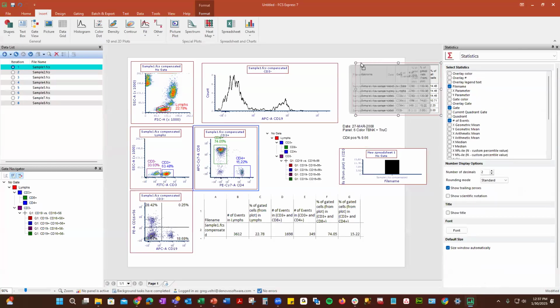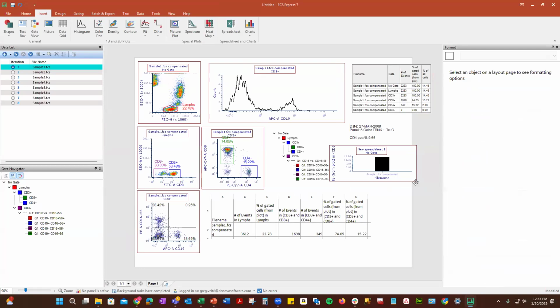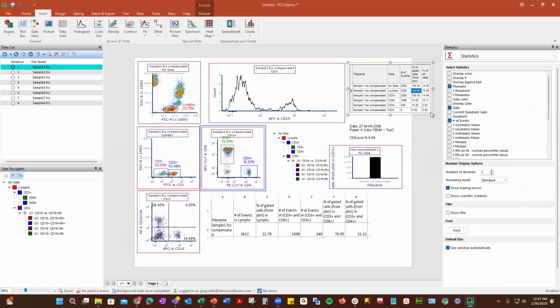All right, so what I would do if I was doing batching, I would set this up the way that I want it to be seen. So let's put it here, like that. Let's change this to maybe like this. Okay, and it's on the sheet.